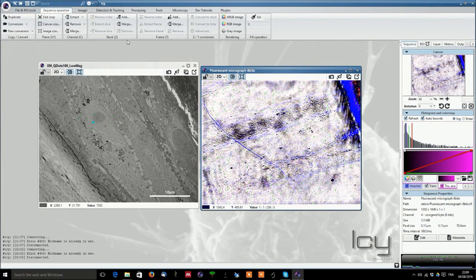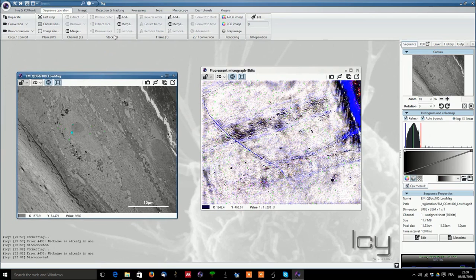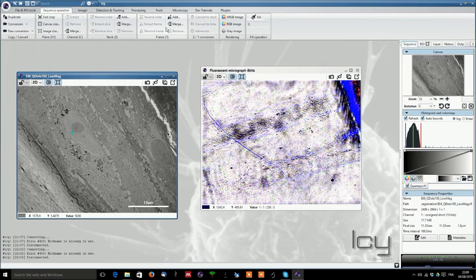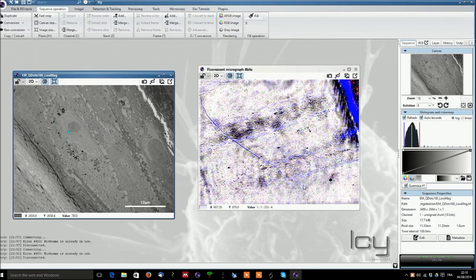Then you can have different informations and you can also adjust the sequence operation. Here you have different things that will help you out to sort your images the way you like. This is a very convenient tool when you're doing quantum dots or you want to have a z-stack and you want to rearrange. When you want to do some processing which are also embedded into the ImageJ file, you can go here into ImageJ.